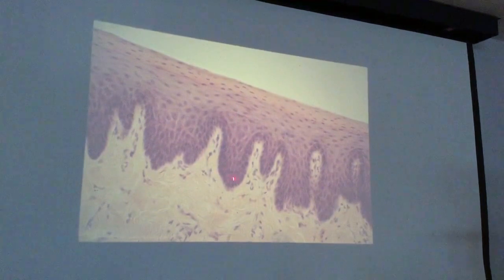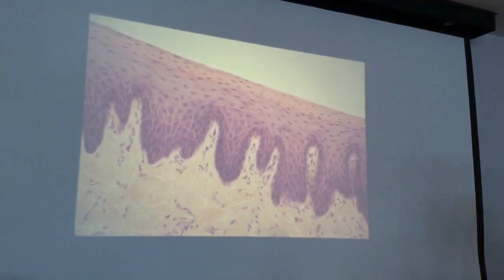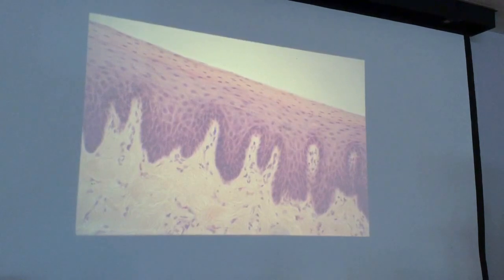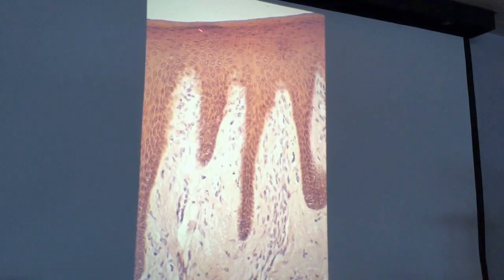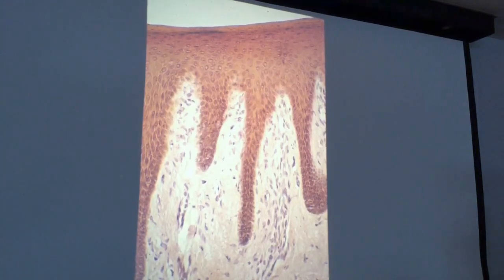Okay, on this tissue, definitely is what, specifically? Parakeratinized stratified squamous epithelium. See the nuclei out there in the stratum corneum. You can see a slight division between the stratum corneum and down here in the spinosum. Unfortunately, in many of these slides, that granulosum does not show up very plainly. Okay, well, there's the stratum granulosum right there. You see the stratum spinosum a little bit better. These nice, deep rete pegs of tissue here, and the papilla giving the gingiva its stippled appearance occasionally.